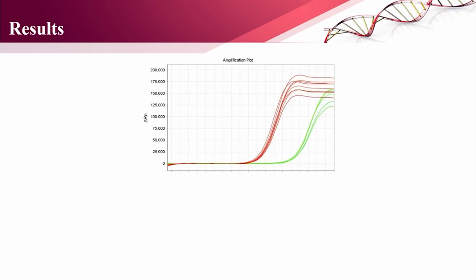So after completing PCR, the PCR product is detected by measuring the fluorescence produced during amplification. As I discussed before, during the cleavage process, the fluorophore then emits light. So the CT, or threshold cycle, or Cq, quantification cycle, as I mentioned before, is a very important thing. We will discuss it more deeply: what is the CT value and what is the Cq value.